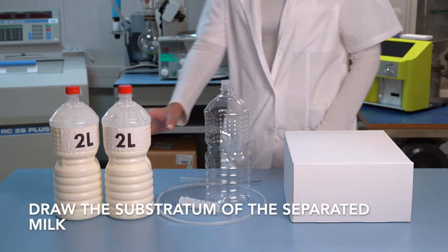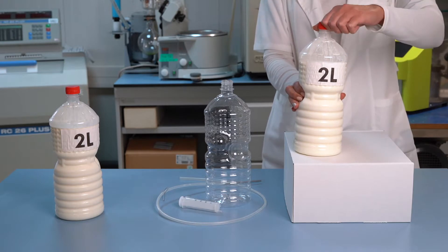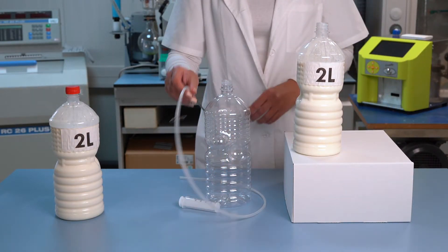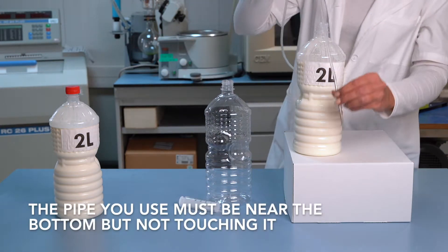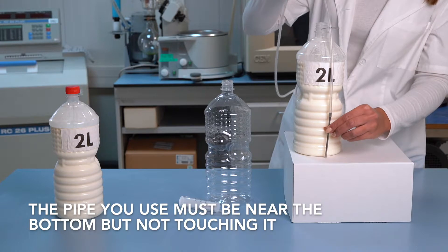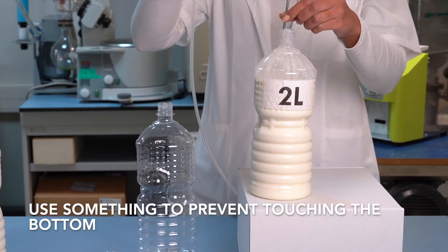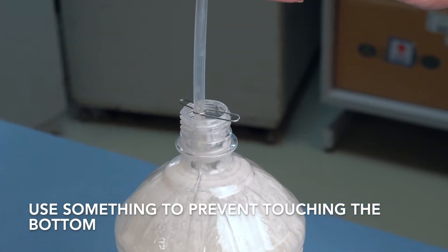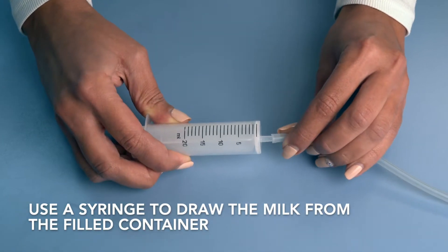Draw the substratum of the separated milk. The pipe you use must be near the bottom but not touching it. Use something to prevent touching the bottom. Use a syringe to draw the milk from the filled container.